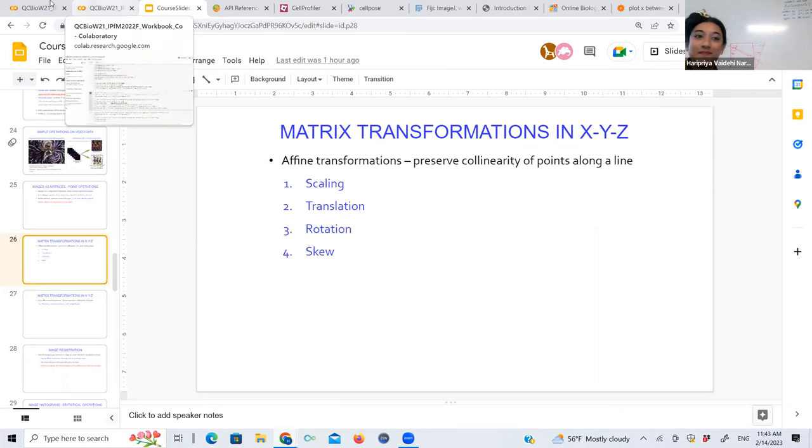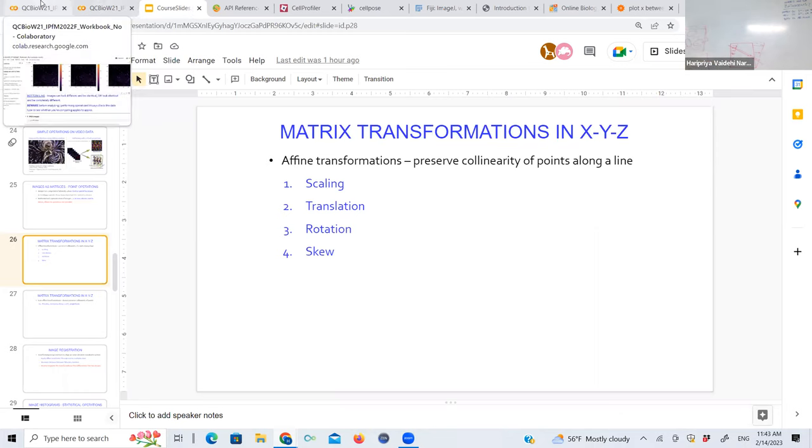So it's rotation, image registration of the rotation. It's a combination of any of these operations. And that's the challenge with registration: to find what is the sequence of operations and by how much you do each of these operations to get image one from image two.